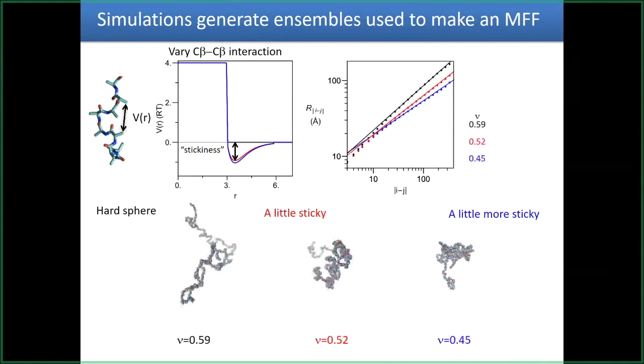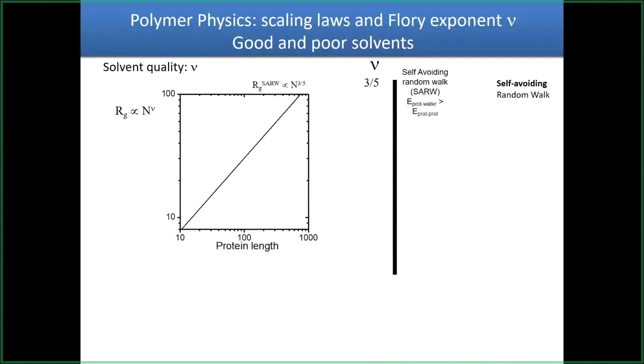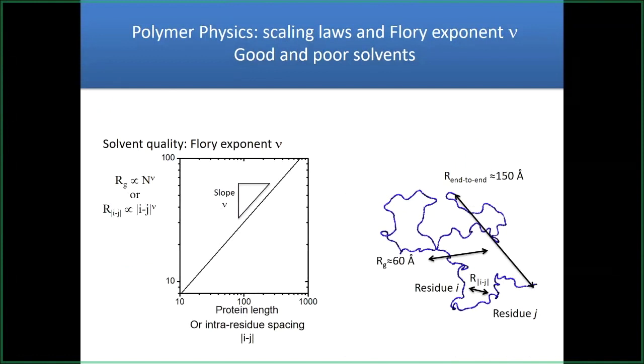We took our ensemble, and for every pair of residues, residue i and residue j, differing by 20, we plotted their average separation distance. That's this y-axis here. If you remember, I had these two different ways of presenting it. I've been showing you Rg versus length, but it's more or less the same as the R between any two residues, or separation. I'm just making sure you see that I switched over to the other one, but they're exceedingly similar.